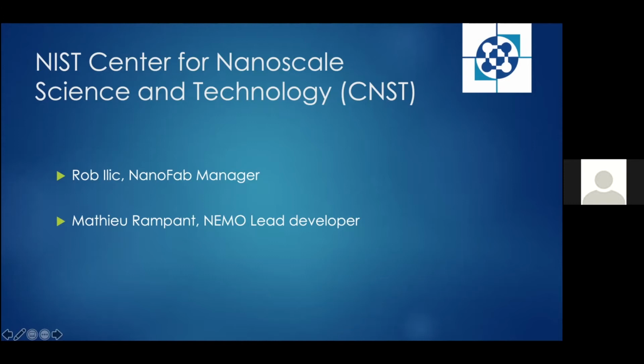Also during the pandemic, we had quite a bit of time. We developed a nearly 600-page feature manual, which is continuously growing with each release of NEMO. And this feature manual really details every single NEMO feature. So as mentioned, we had lots of developments and are continuously developing NEMO.